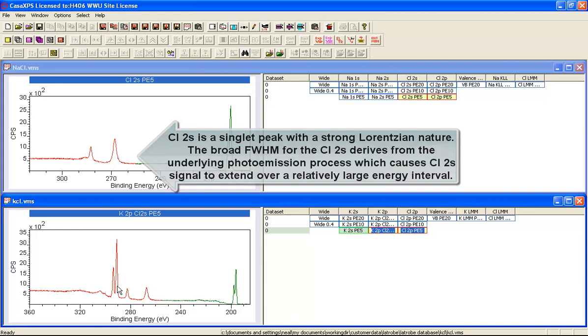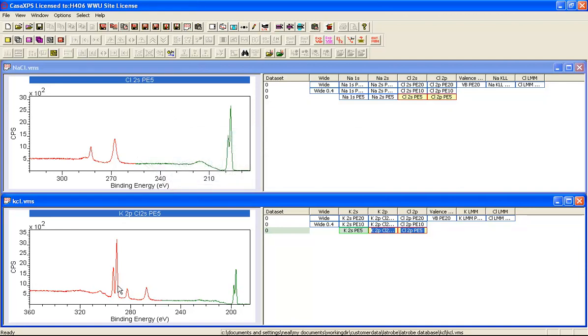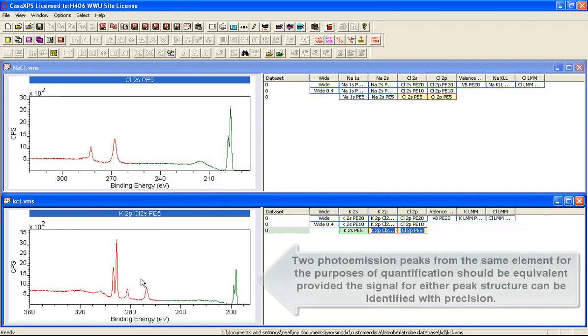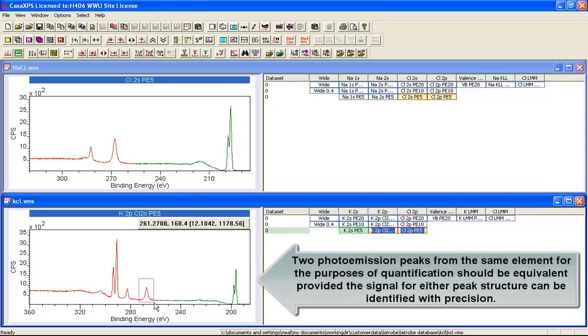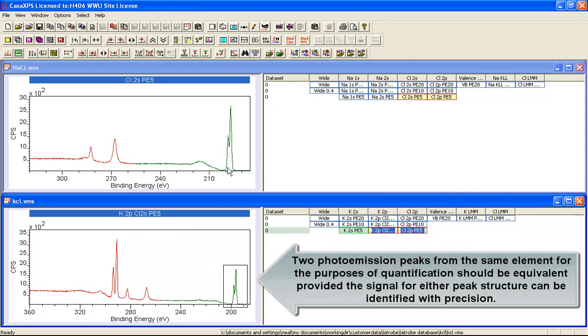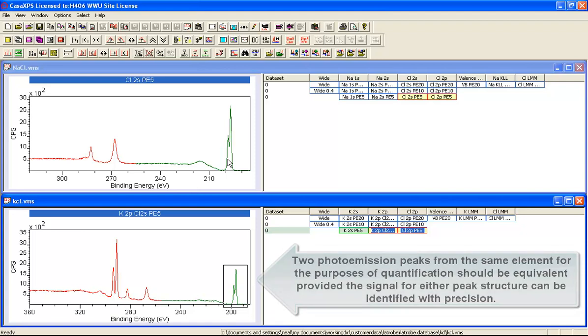If we do the same display in the potassium chloride we've also got a doublet from the potassium here. This is the carbon, there's the chlorine 2S and this is the chlorine 2P. So we've got two very similar sets of spectra which we can use to try and understand how to quantify chlorine.